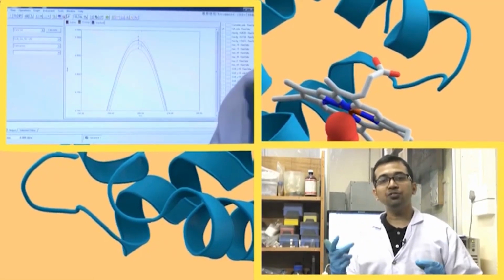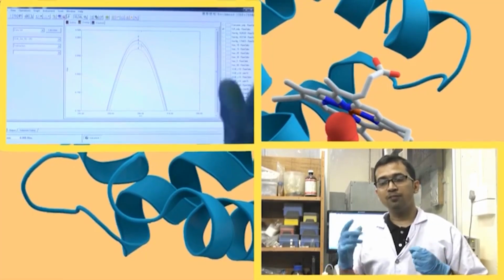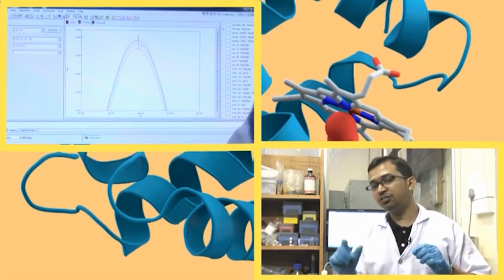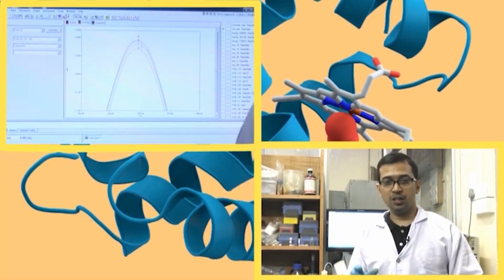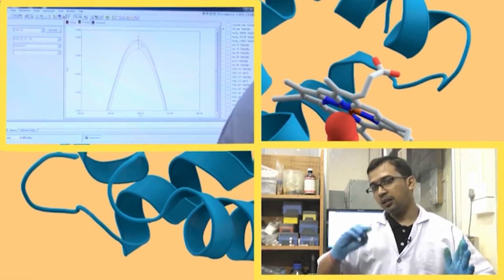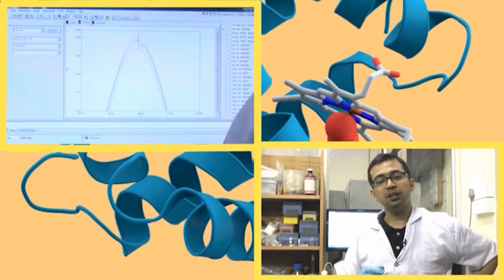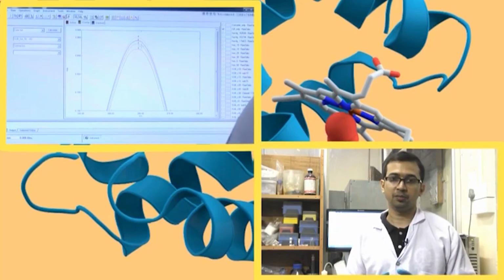From this plot we take the ratio of the intercept and the slope. Intercept by slope gives us the Ka value. If we compare the Ka value between curcumin and gallic acid, we can know which one interacts with the protein, and we can quantify the extent of interaction.